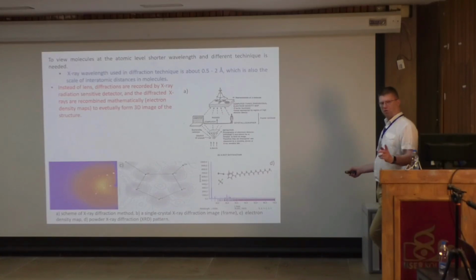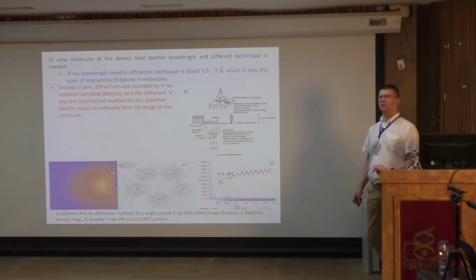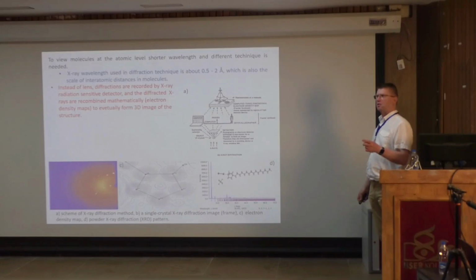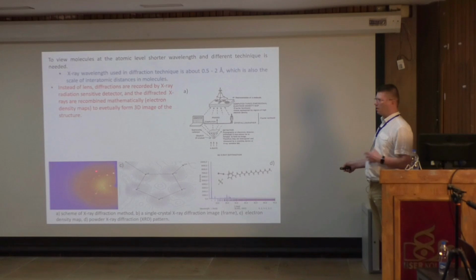And now there was a question about the reciprocal lattice point. So each of these diffraction spots represents one particular part of the crystal where the diffraction from that space happens. And it reflects itself as a point here in the detector. And we can consider this.